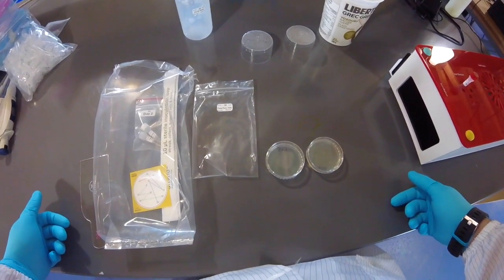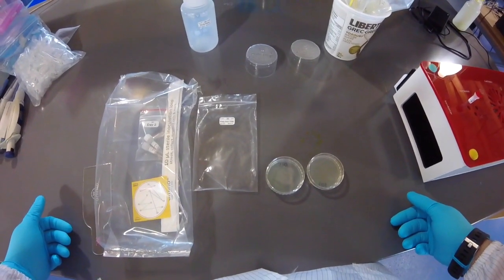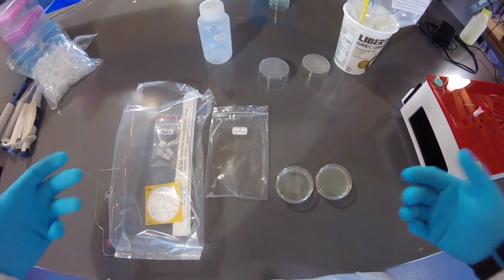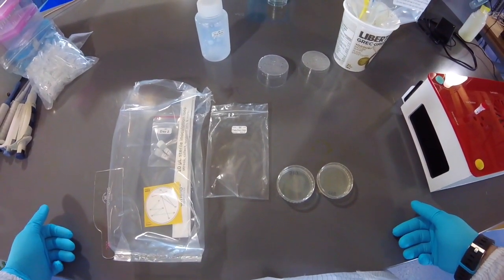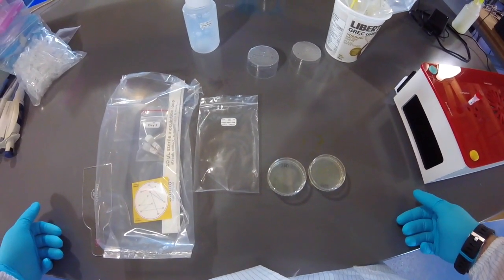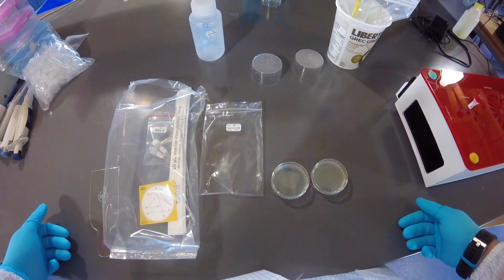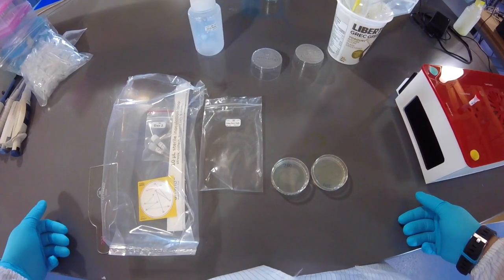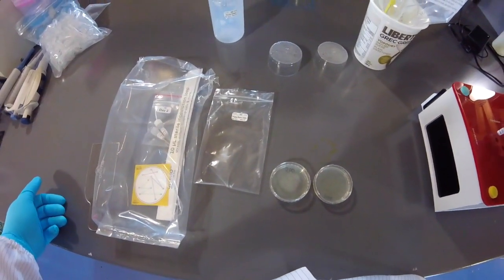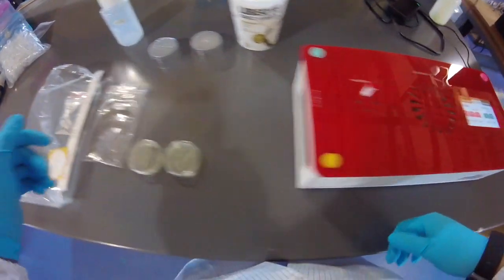And then at the very end of yesterday, or day 2, we mixed those transformed or heat shock cells with some recovery media in order to dilute the high concentration of salts, namely calcium, so that the cells could withstand the calcium, but then also to give those cells some nutrients, sugars, amino acids, etc., so they can start growing and dividing again. And then we put those at 37 degrees Celsius overnight, and here we are today.